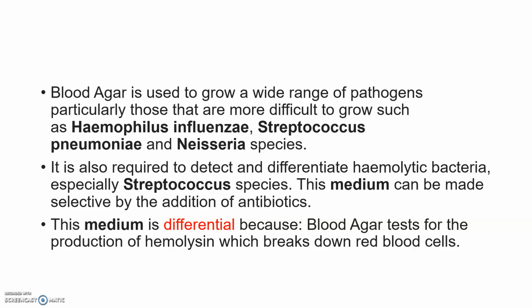The medium is also differential because blood agar tests for the production of hemolysin, which breaks down the RBCs.